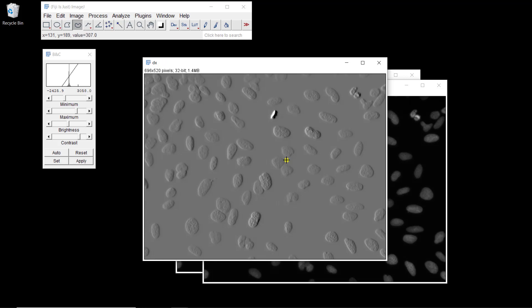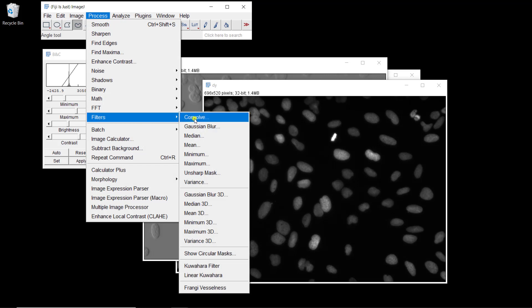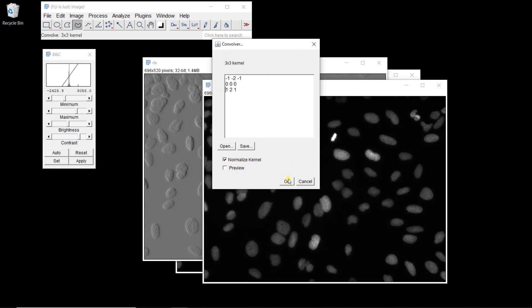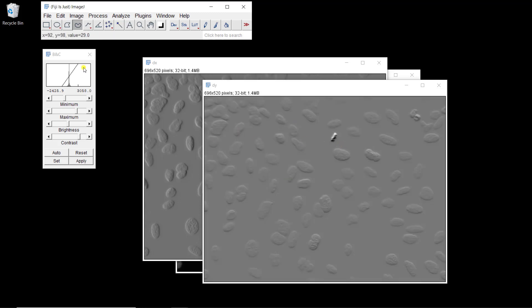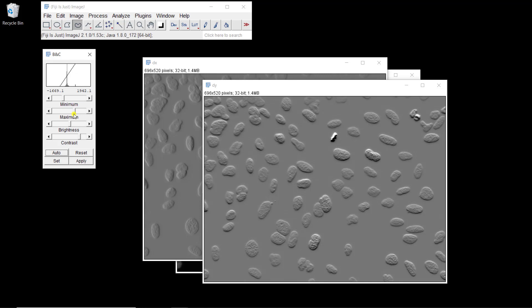If we apply the Y derivative, we should have high values at the top and bottom of the nucleus. Let's go to Process > Filters > Convolve, and define the derivative in Y: minus 1, minus 2, minus 1 in the first row; 0, 0, 0 in the second row; 1, 2, 1 in the third row. We have a 3 by 3 kernel, so it's fine. Let's apply it. Now we have something similar, but instead of identifying contours on the left or right of the nucleus, we now have contours at the top and bottom.